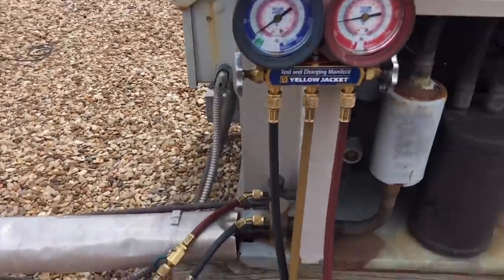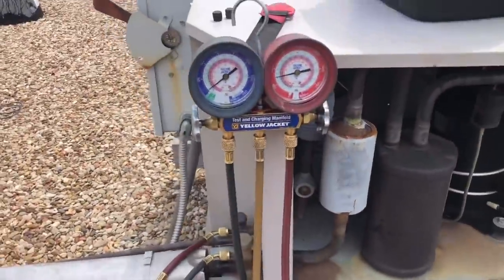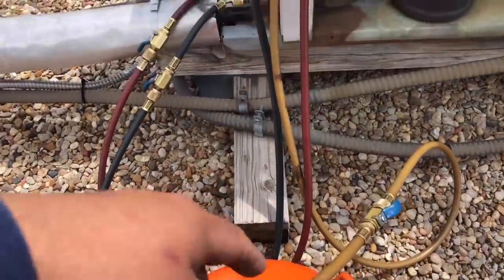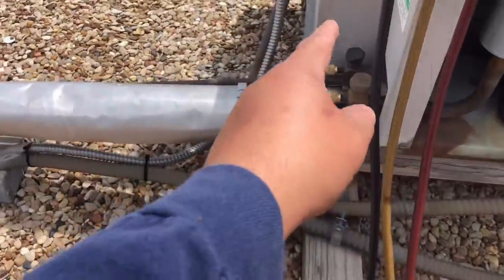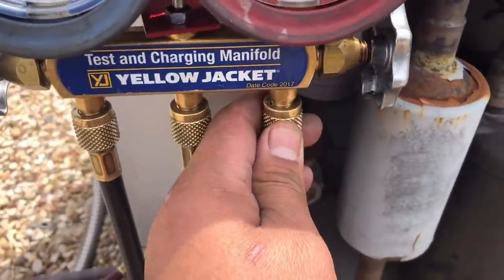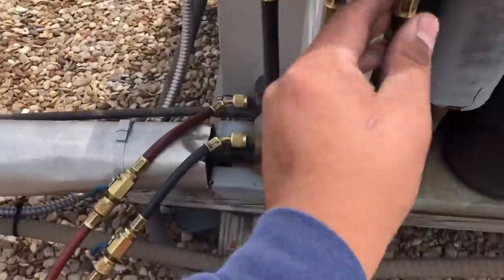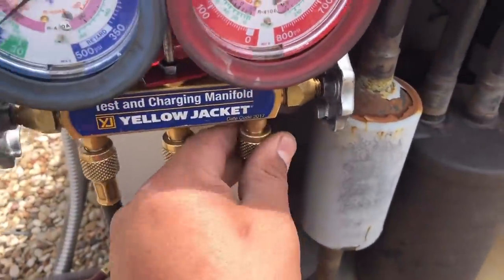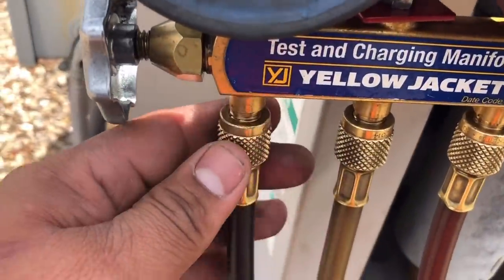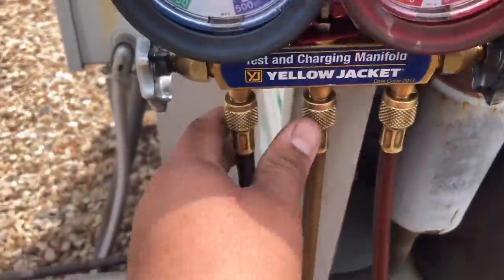Then we'll add some more for winter charge. Starting with the basics — I'm going to purge my hoses. Once you hook up, you want to come right in here. See, this system doesn't have a whole lot of liquid, so just purge it for a few seconds and you'll get all the air out of this hose. Purge this one for a few seconds, get the air out of that hose.